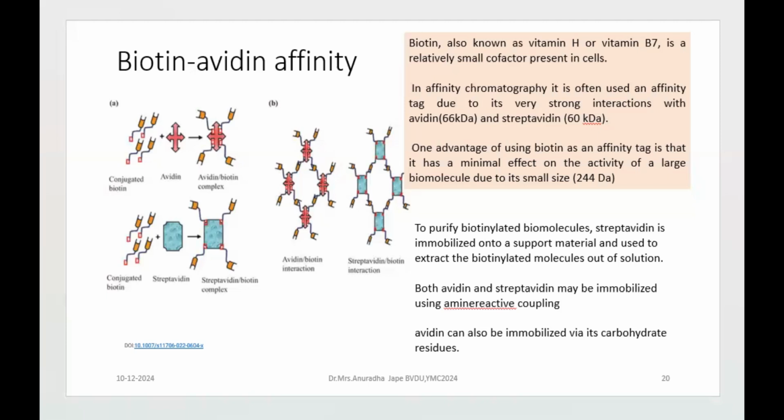So for example, if your ligand is 5 prime AMP, that is adenine monophosphate, it can reversibly bind to many enzymes which are NAD dependent. So NAD dependent dehydrogenases can selectively bind with 5 prime AMP.